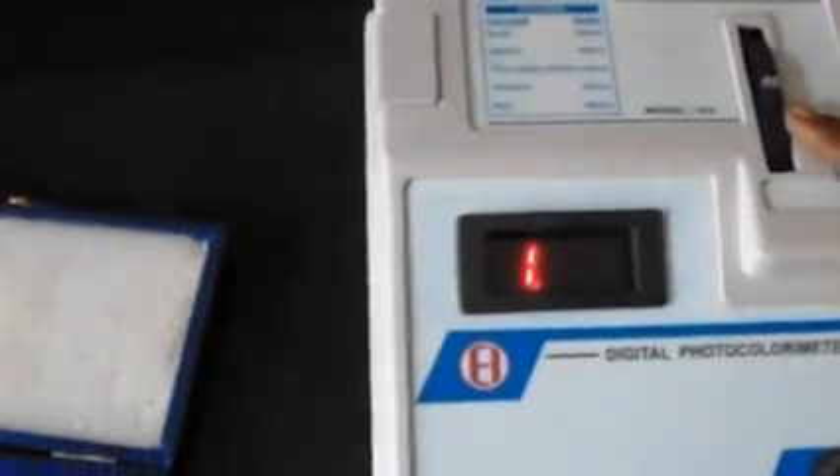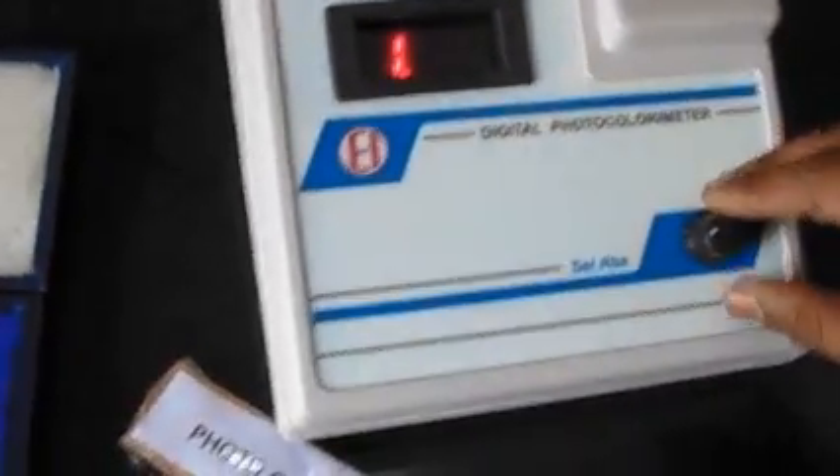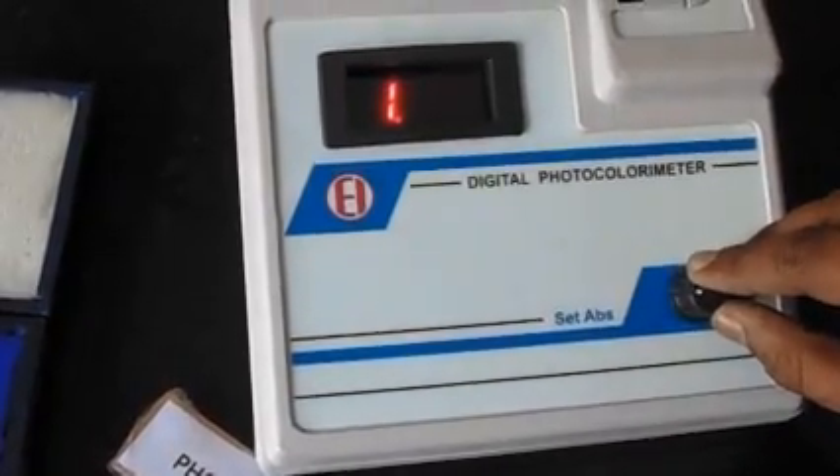A shutter control is provided inside. The shutter, which is the test tube holder, automatically blocks the light path to the detector when the test tube is removed. There is also a knob to set the zero OD.